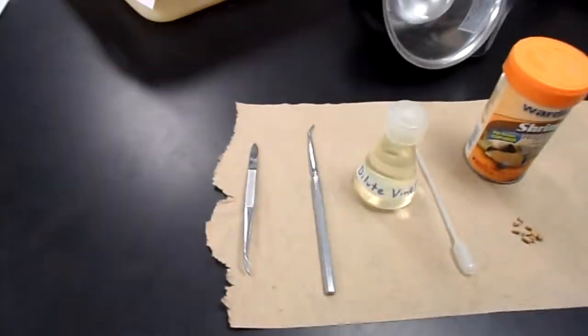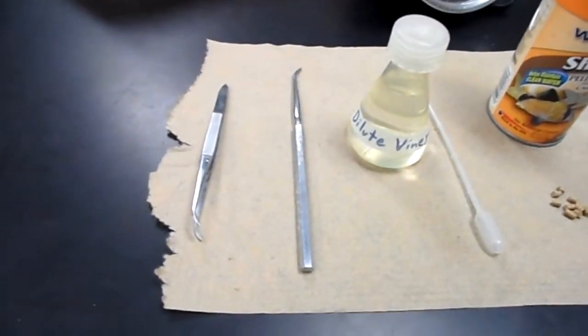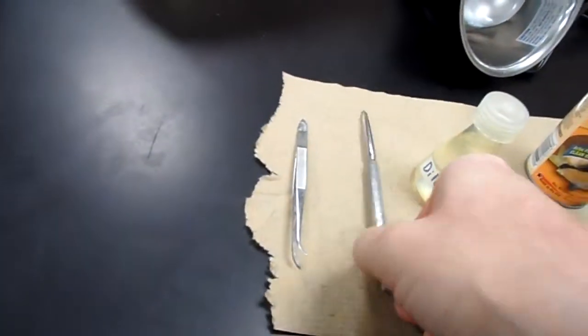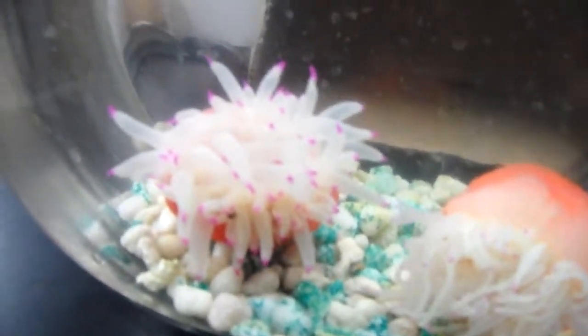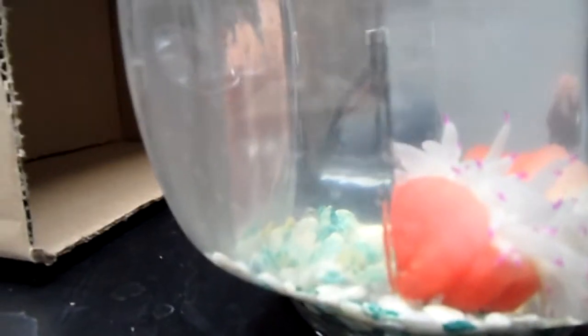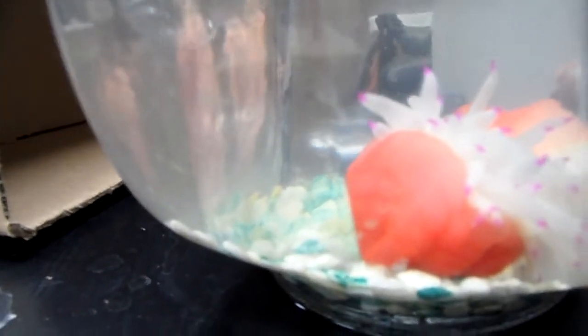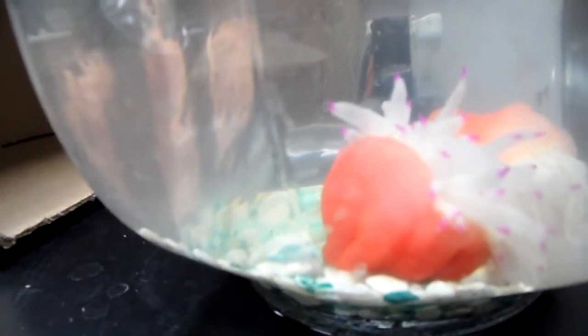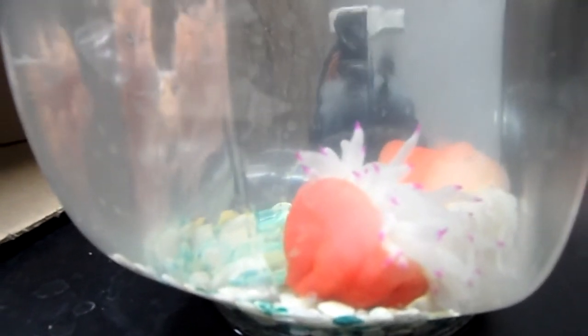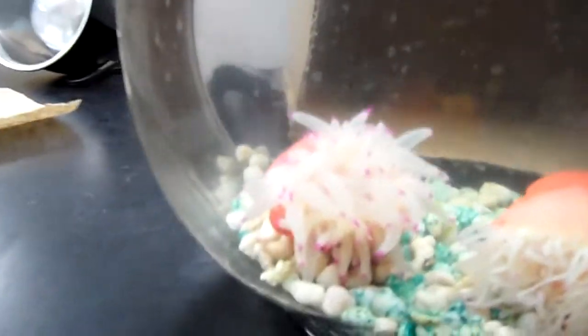The second part of the lab has to do with can anemones sense touch? And to do that, we're going to use the blunt metal probe. Now, the anemone may be sensitive to touch on different parts of its body. And if you'll recall, an anemone has a basal disc that it uses to attach itself. The body form that an anemone is in is a polyp, and so they're attached by their basal disc, and their tentacles are facing upwards.